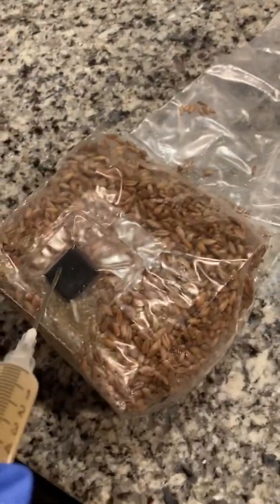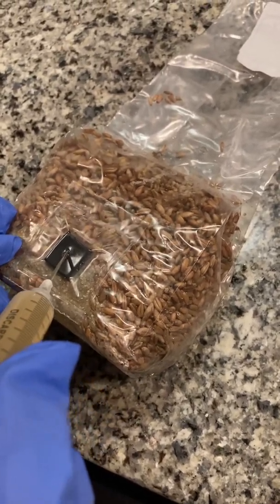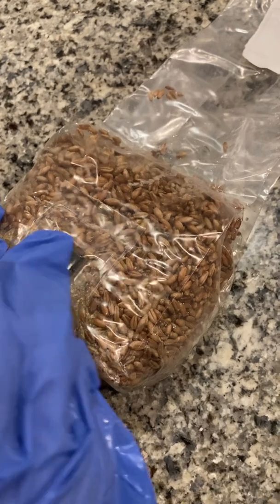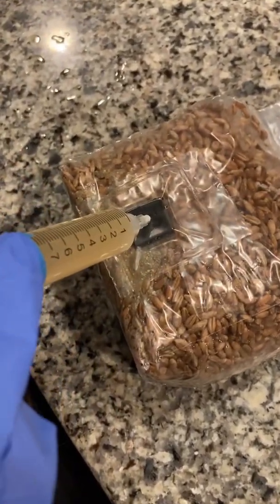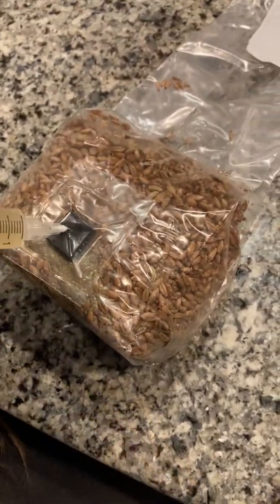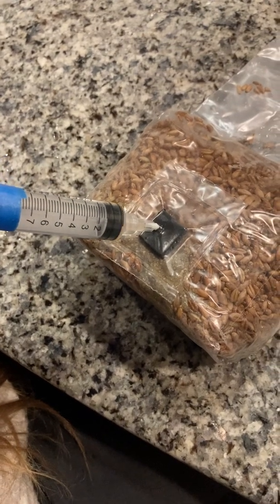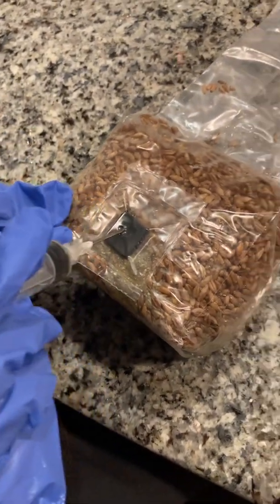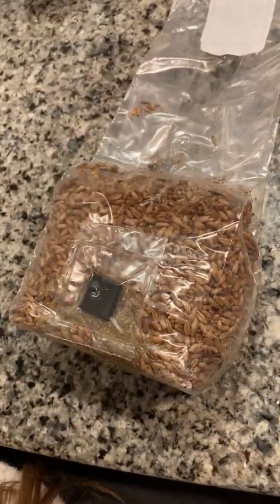Now we're going to inject the spawn bag. We're going to go at about a 45-degree angle towards one side and do half of the injection, then turn it to do the other side of the bag and inject the rest. And that is how you inject a grain spawn bag.